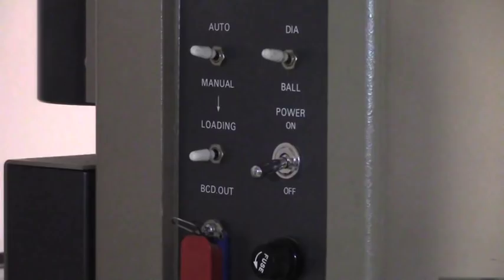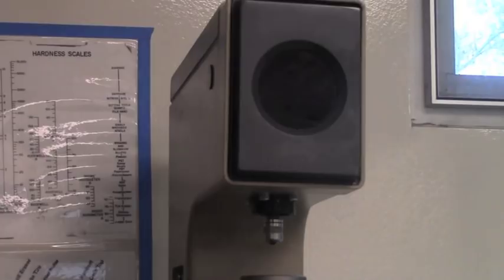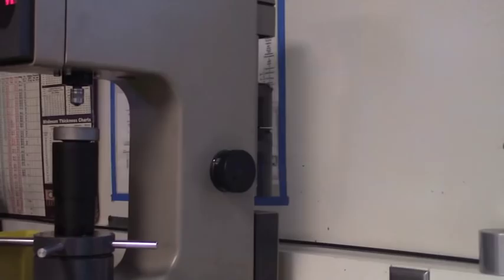The machine output screen should read 100, indicating the machine is ready to run the test. If the output screen reads anything other than 100, toggle the machine's power from off to on. This will reset the machine.